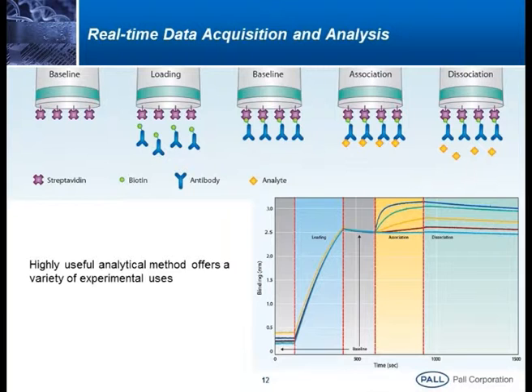Giving an example here, one of the sensors is a streptavidin coated sensor. The matrix is streptavidin here. I am immobilizing an antibody which is biotinylated, and if you look, there is a response like this. The sensor just shows a baseline.